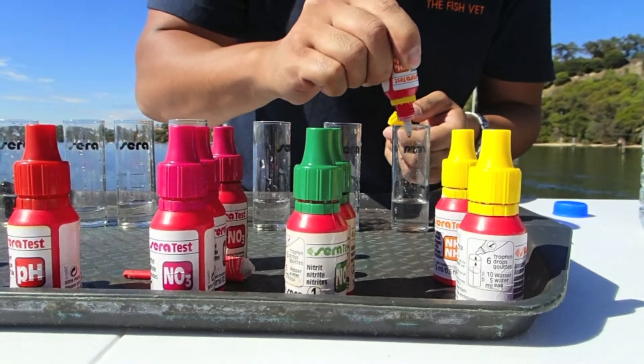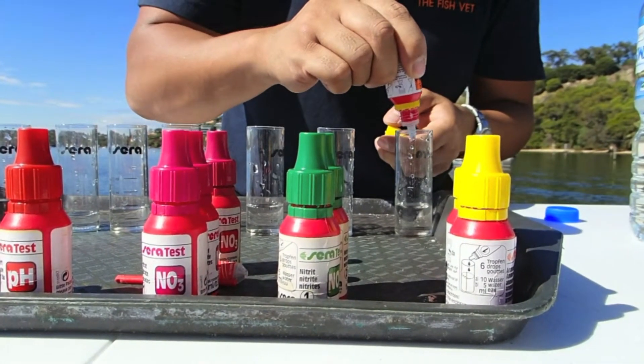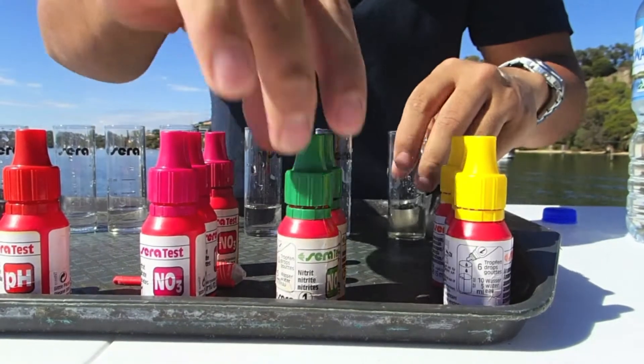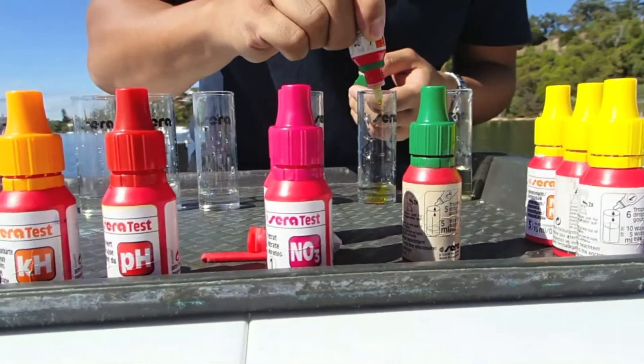Give it a shake. And it's also easier to shake the wider the bottle is. 1, 2, 3, 4, 5, 6. Give it another shake. And then 1, 2, 3, 4, 5, 6. And then just proceed on with testing the others while you've got time for it to react.